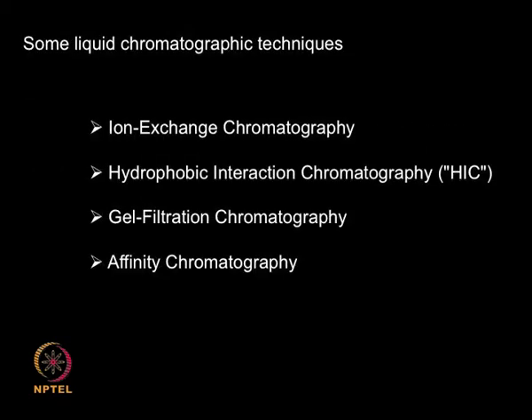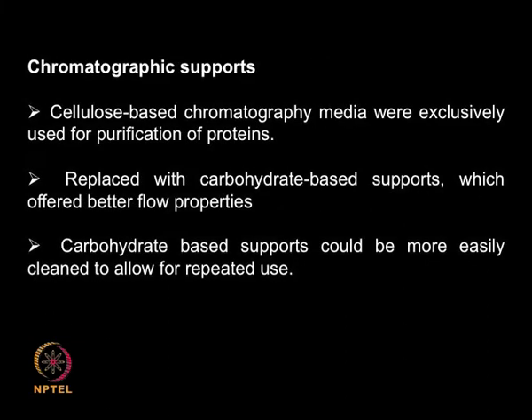So some liquid chromatography techniques: ion exchange, hydrophobic interaction, gel filtration, affinity, and so on. Actually, we will be spending time on each one of them in more detail. What are the supports the stationary phase is going to have, or the fixed phase?